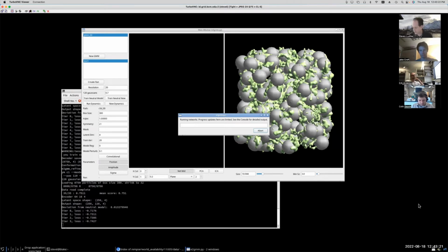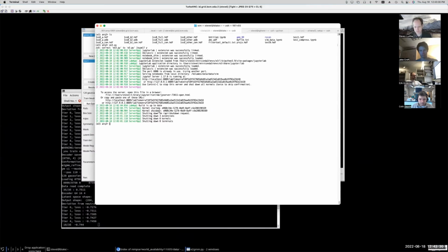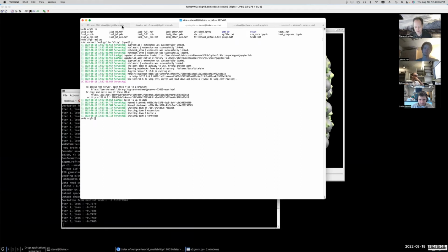And unless someone else has another question, which will be faster to answer, I can do that too. All right, we'll look at the Python code. Let's see. Yeah, we'll just do it here. Oops, where am I? Oh, sorry, I'm in the data folder.